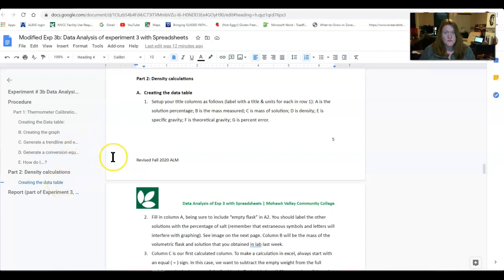Instead, it gives you instructions for how to show using shapes drawn on the spreadsheet where your unknown happens to occur. Okay, so this is called graphical analysis, and so it's used anytime we have a graph and we have one variable we know about and we want to find the other one.